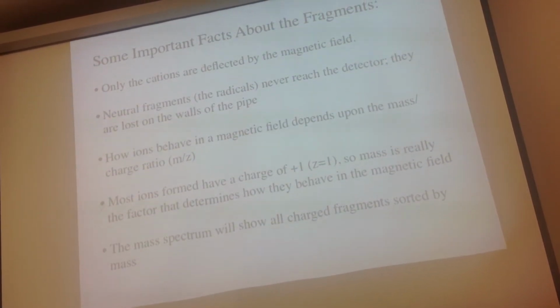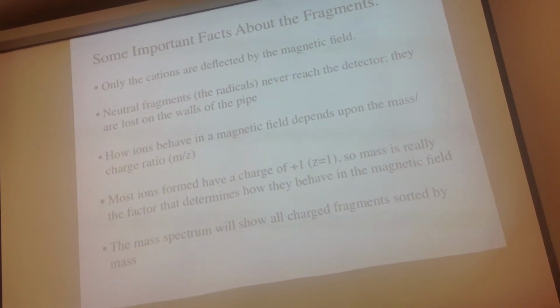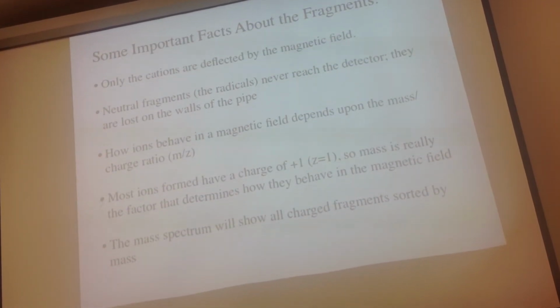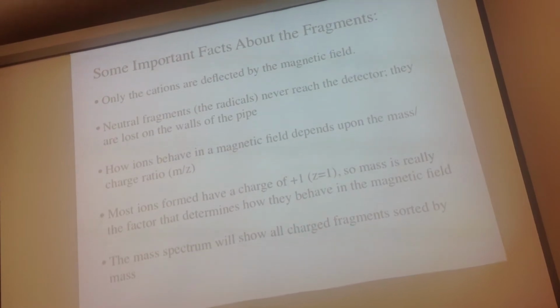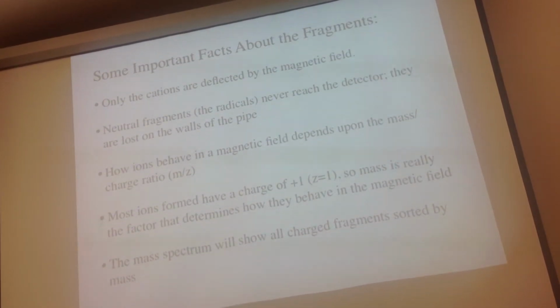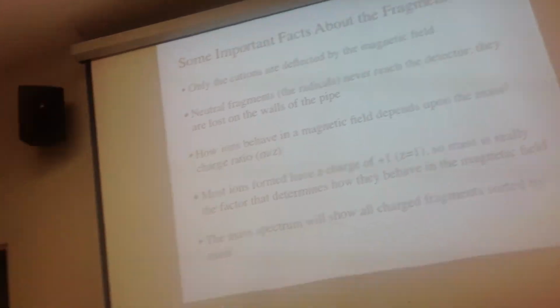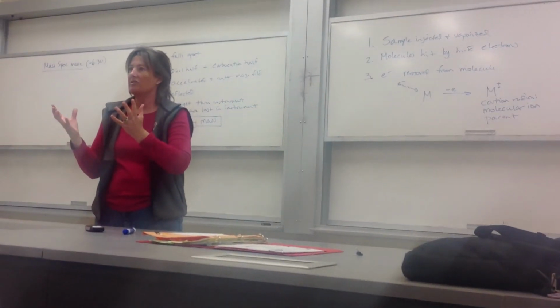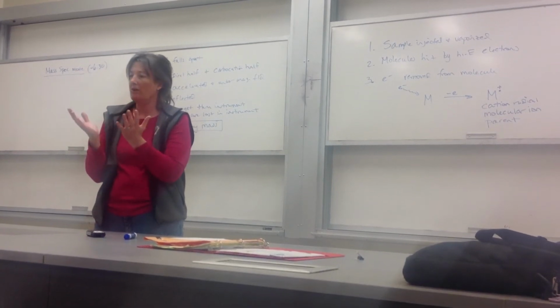So we're going to be going through and just looking at functional groups. We'll take a look at spectra and try to figure out what piece it is, what cation gave me that particular peak. Okay, we're not going to do them all. One of the things that gets complicated about these is we may, and we're going to run into this probably right off the bat, see a really big peak. And we'll look at all our fragments, and no matter how we chop this molecule, we can't get that mass. And it's like the base peak sometimes. And it's a mass that you're just like, where did this come from?